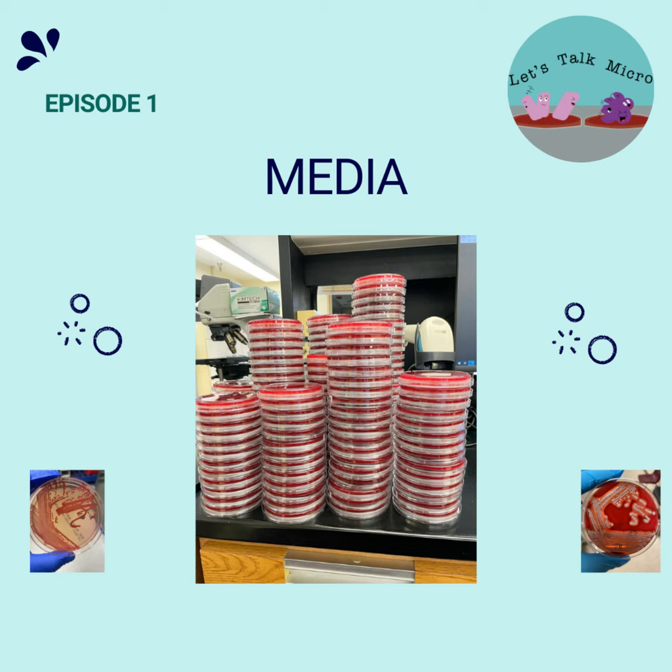And here's for your students out there, here's where you have to be careful. You have to be as specific as you can be when you're describing the purpose of this agar. These are very typical questions that get asked, maybe if you're doing a clinical rotation at a hospital or taking a micro class. For example, if I give you a test and ask what kind of media MacConkey is, and your answer is that it selects for gram-negative.